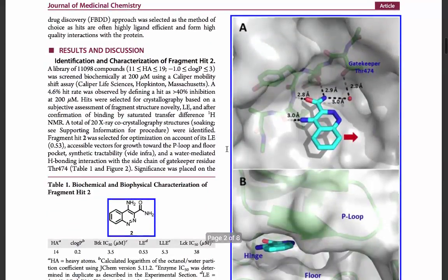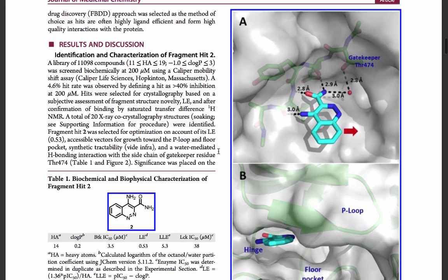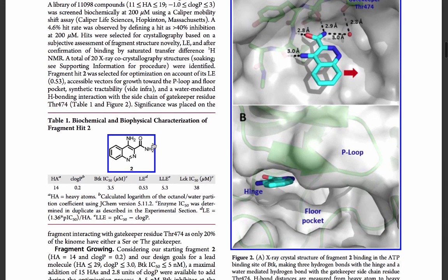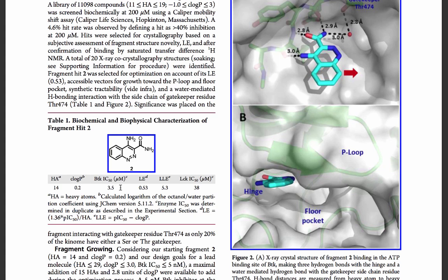Takeda did a fragment screen by Caliper Mobility Shift Assay and they came up with the promising fragment hit number two here, which binding profile looked quite promising. Potency was 3.5 micromolar and the compound was also quite selective.